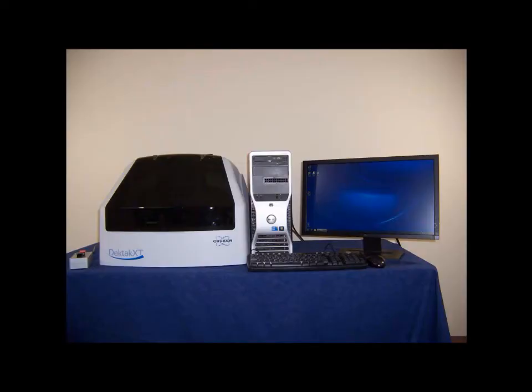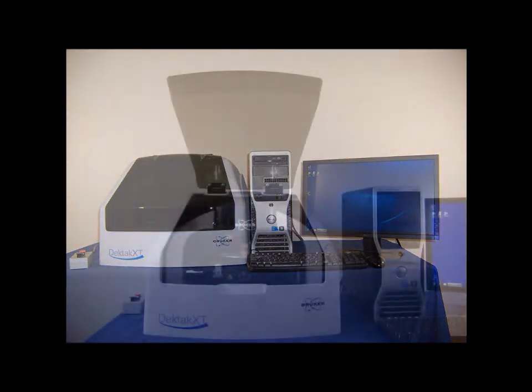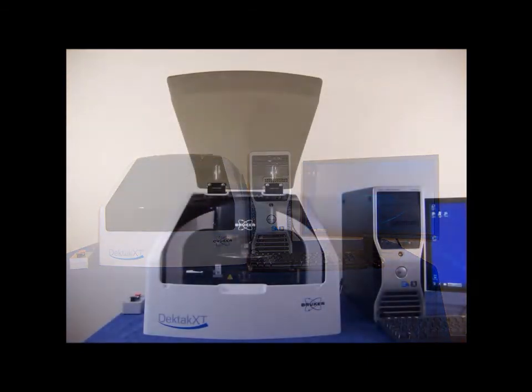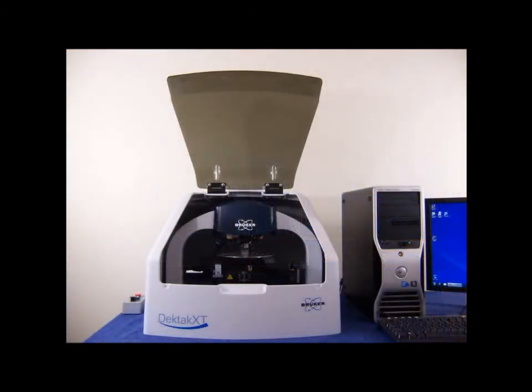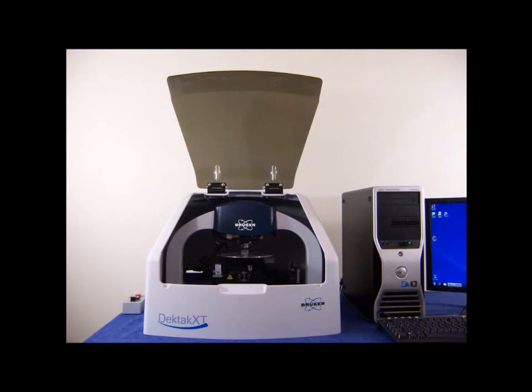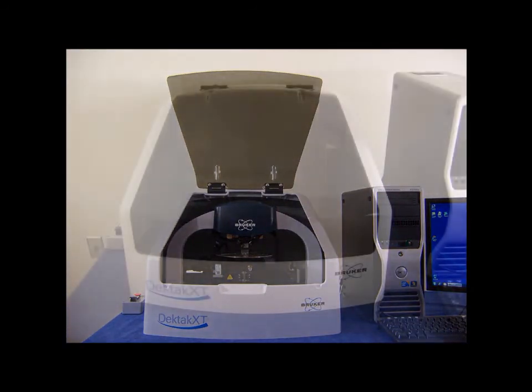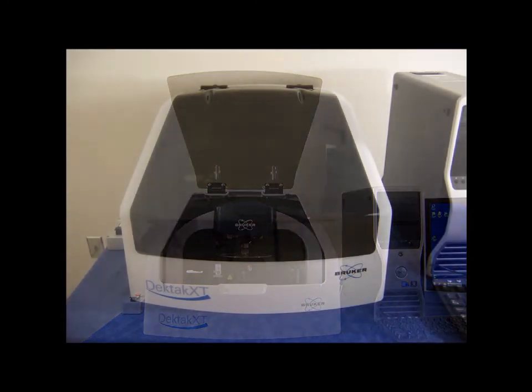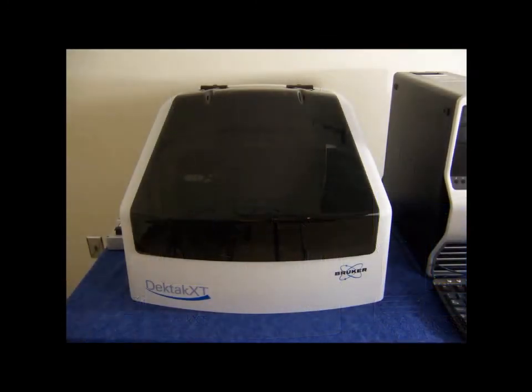The DECTAC XT is equipped standard with an environmental enclosure. The enclosure protects the sample and scan area from adverse outside influences such as acoustical vibration, dust, and air currents. The enclosure has a front door which lifts to allow sample access. Measurements should always be run with the enclosure door closed.